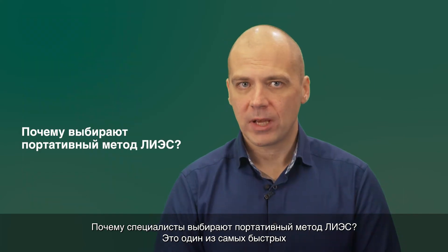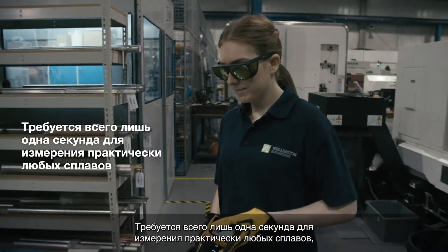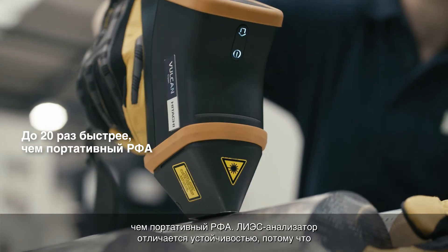Why do people choose the handheld LIBS technique? It is one of the fastest analytical technologies available today to identify and analyze metal alloys. It takes just one second to measure virtually any alloy, including aluminum alloys — that's up to 20 times faster than handheld XRF.